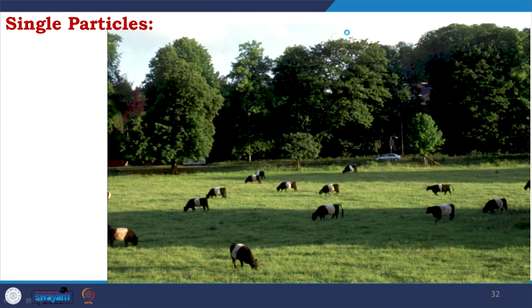So, let us start thinking about a single particle. All the cows roaming here, considering cows as single particles. Then we collect data, and the signal to noise is low.